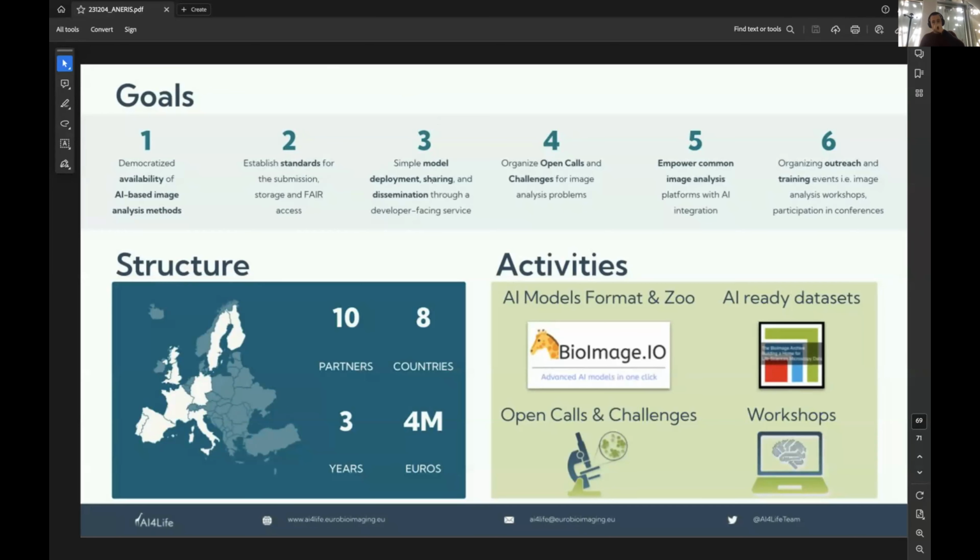Yes, so in the documentation, we have a description of all the parameters that need to be changed. It is, I agree, a bit daunting. In general, we have a link to the documentation, and we try to document as much as possible. In my opinion, we're still a bit light there.